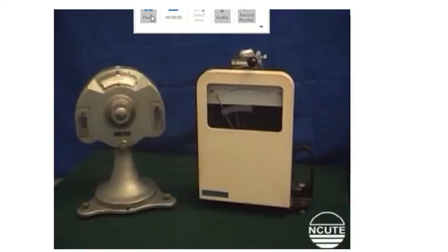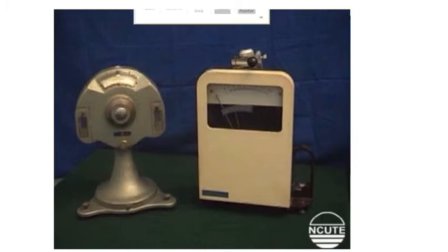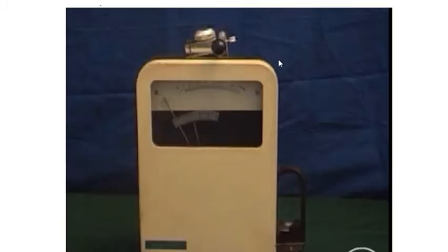Now let us look into the total instrument and how the experiment is done in this instrument along with the slide description of the instrument. This is the Stelometer and the left side is the torsion balance. Instead of this torsion balance, we can use a micro balance. This is a close look at the Stelometer.